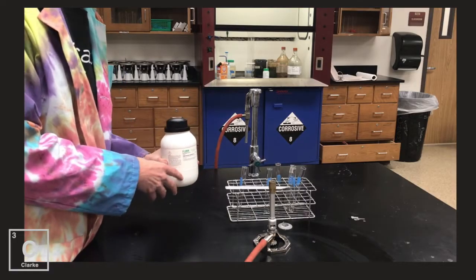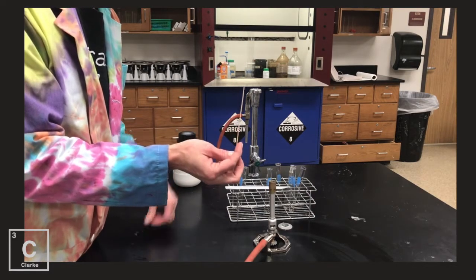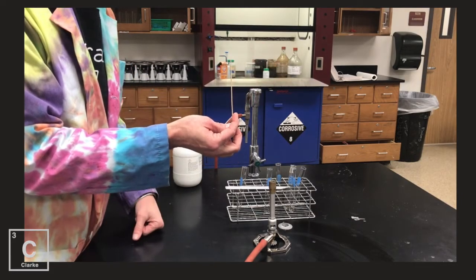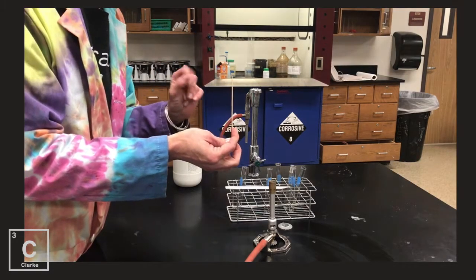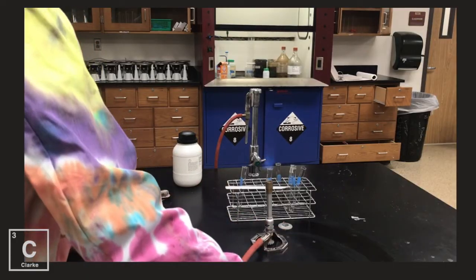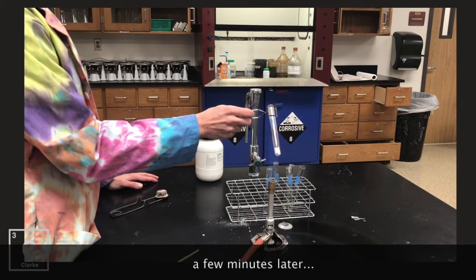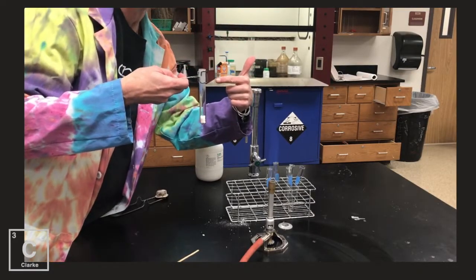I'm first going to waft the vapors and see if I can identify any smells. I'm then going to use a wood splint — I'm going to light it on fire and test the gas. If it's oxygen, the embers on my wood splint are going to relight. If it's hydrogen, when I dip the stick down with the embers glowing, it's going to pop. If it's carbon dioxide and I dip the embers down, it is immediately going to snuff out the ember or flame. That's ammonia — ammonia's chemical formula is NH3.